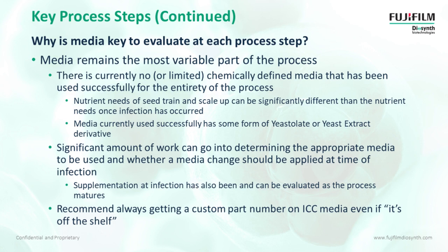And one thing I always recommend is to get a custom part number for your media, even if it is considered off the shelf, and that just allows you to have a little bit more control and management over that media over the life cycle. So if there's some sort of change in yeast hydrolysate or yeast extract, you have a lot more control and management over that with the media vendors if you have your own custom part numbers.